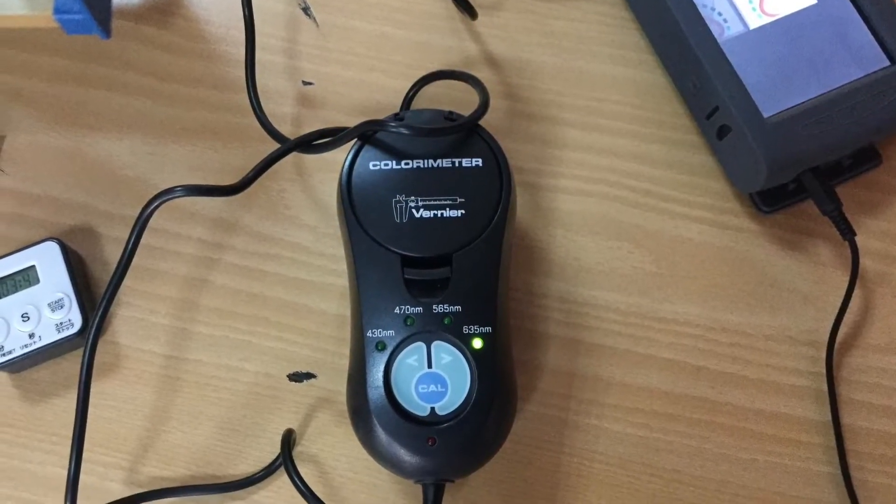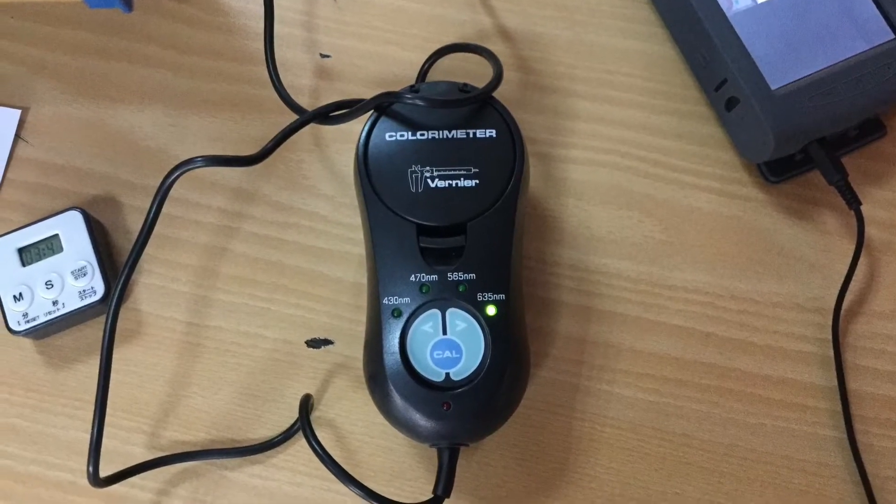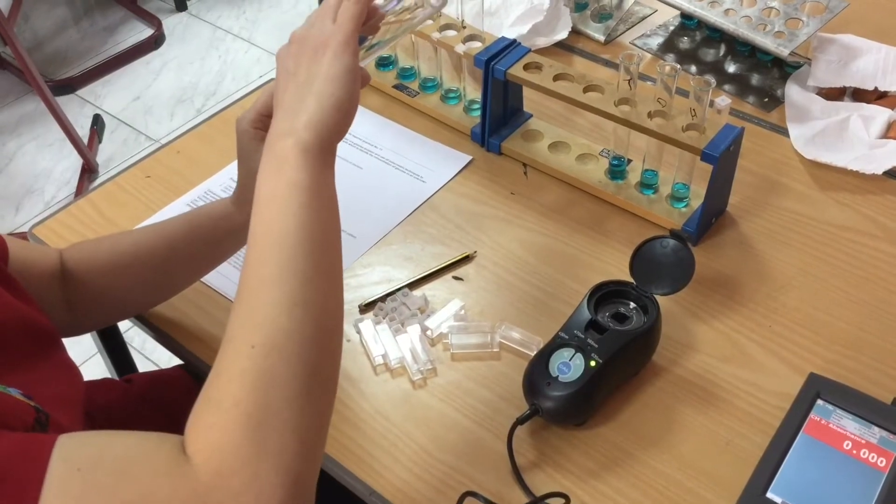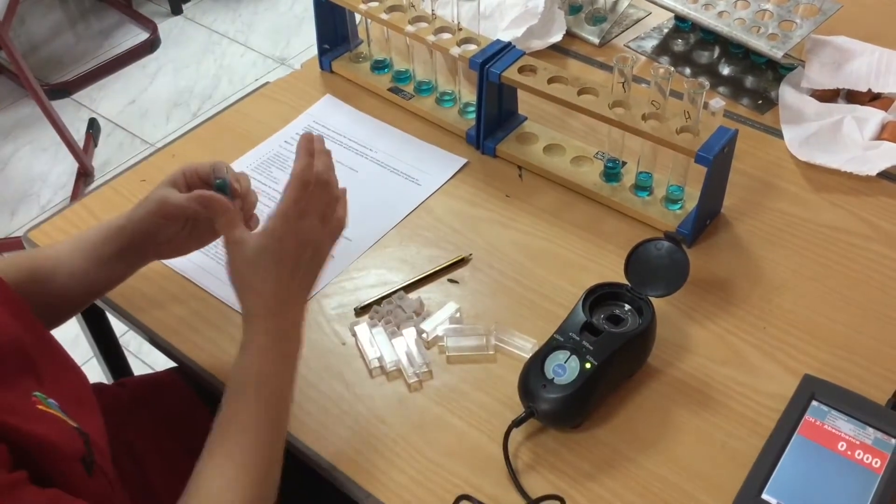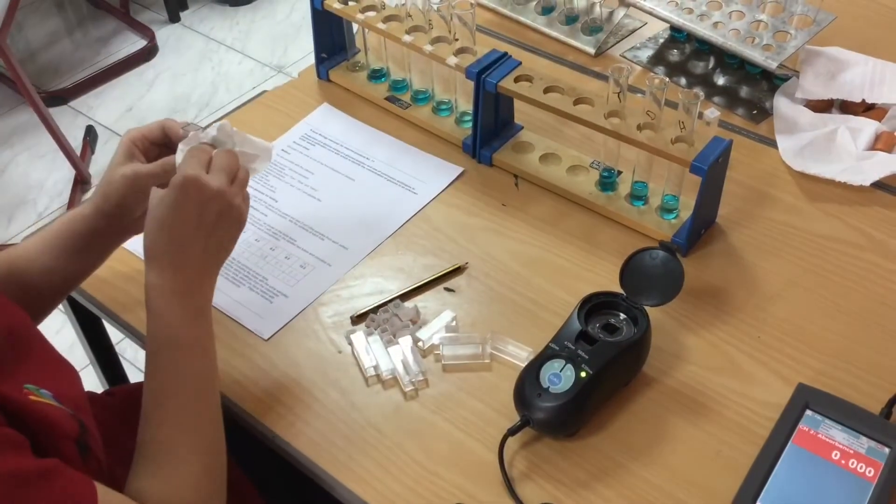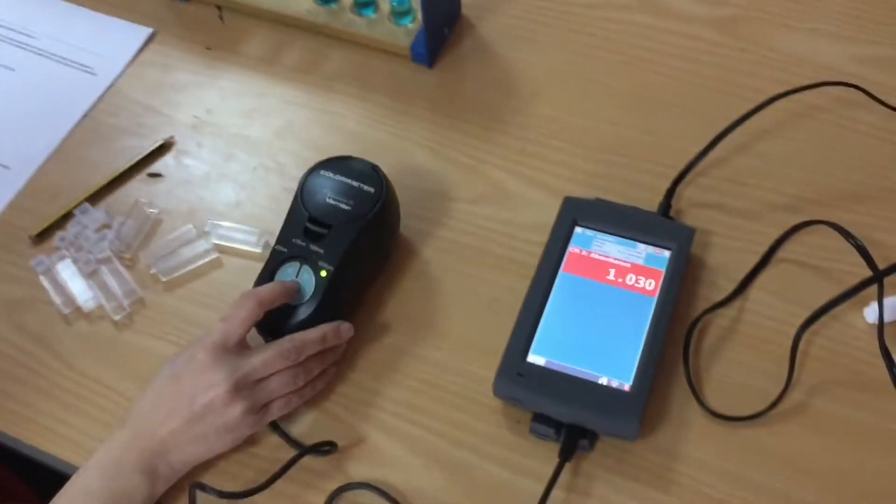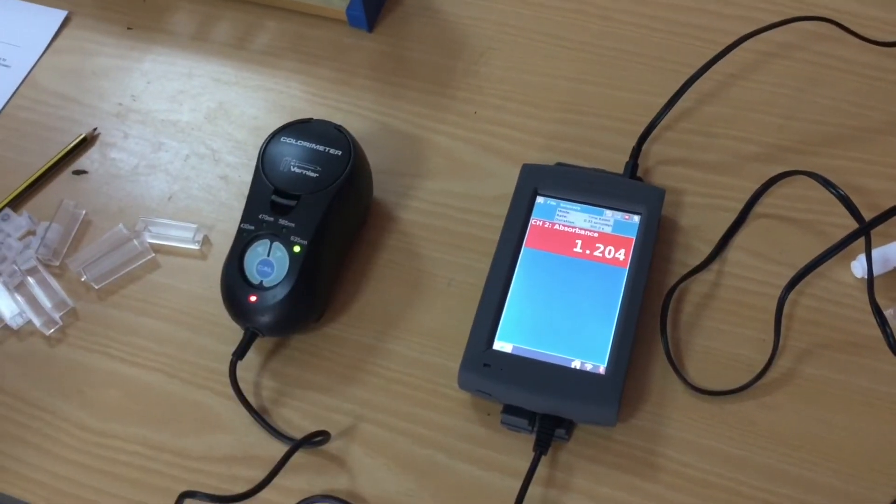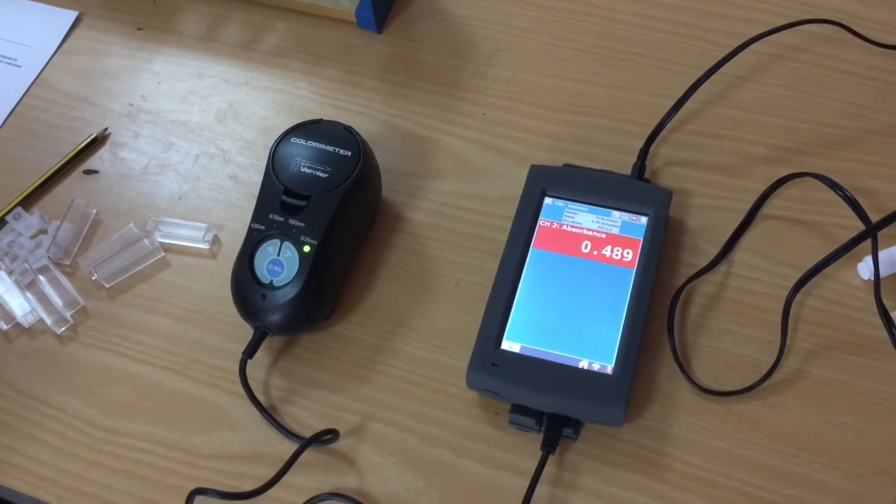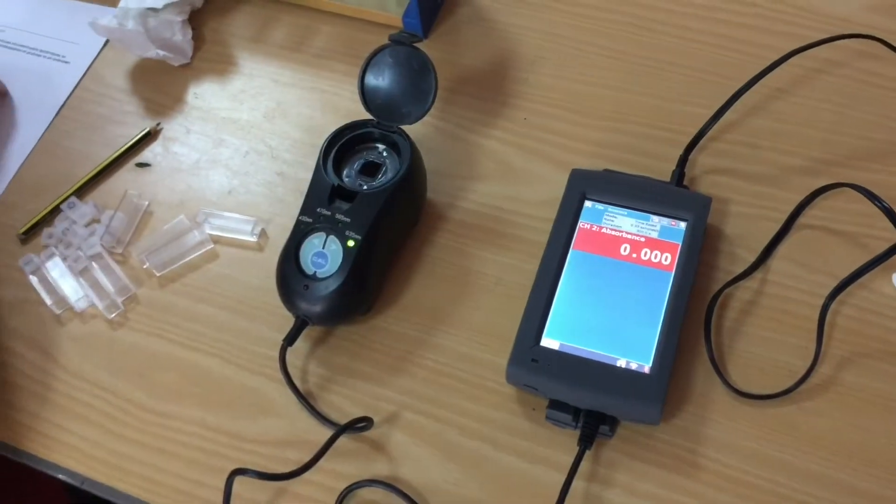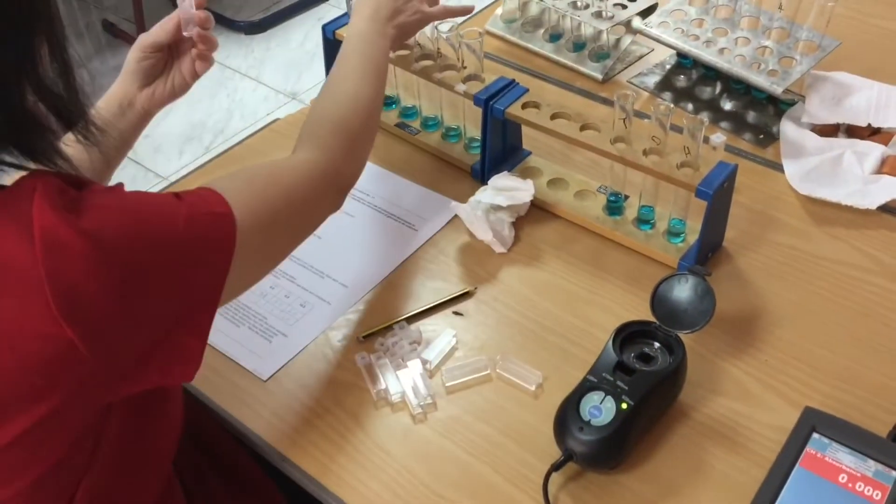Initially I calibrate my colorimeter with pure Benedict solution but I soon find it doesn't work and the reason why is because all the solutions that have contained glucose are now paler and therefore have a lower absorbance than the actual Benedict solution. So this would give us a negative value for absorbance and that can't be read by the colorimeter.